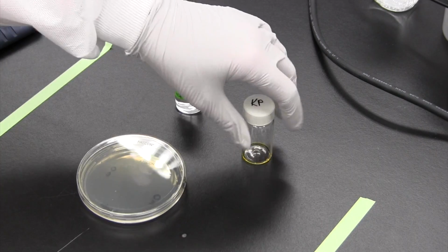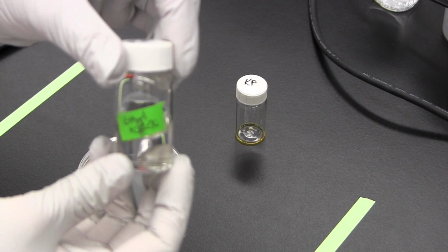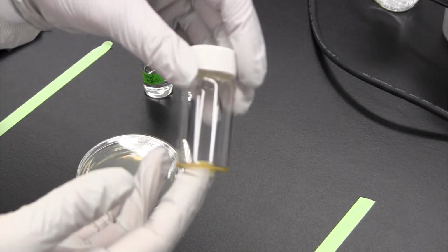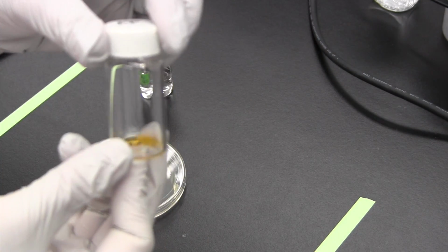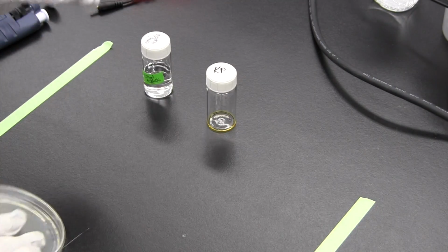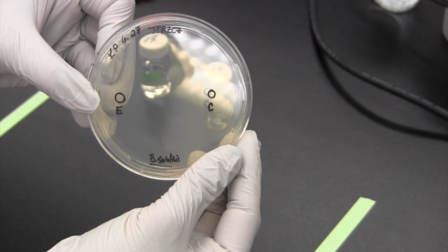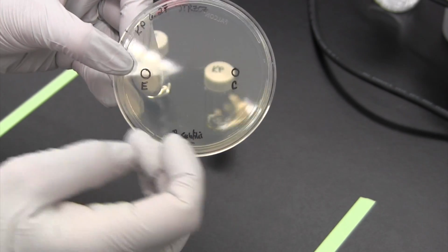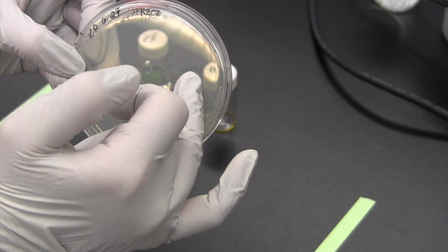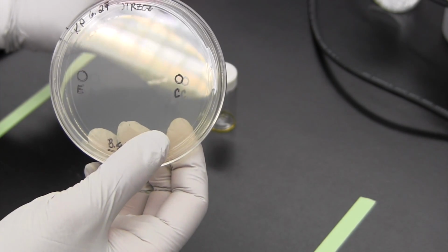In order to set up for this experiment, you're going to need a small aliquot of ethyl acetate, which you can see here. This is just plain ethyl acetate. You'll also need your resuspended extract, but you have to work fairly quickly because this is going to evaporate off pretty quickly. And then we have an LB plate that we have labeled. The most important part of the labeling is that you have marked on your plate where you're going to dot your extract and where you're going to dot your control. In this situation, the control is our plain ethyl acetate.